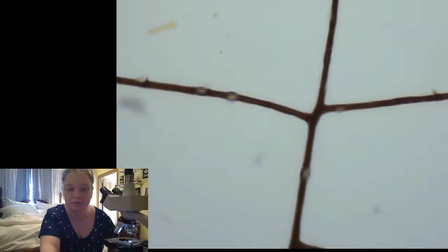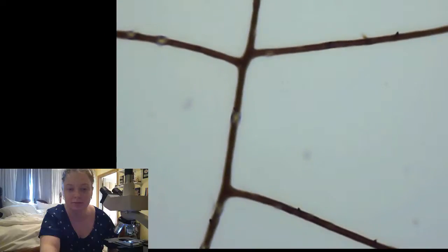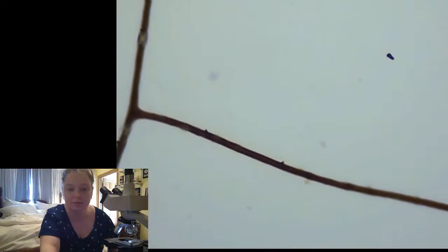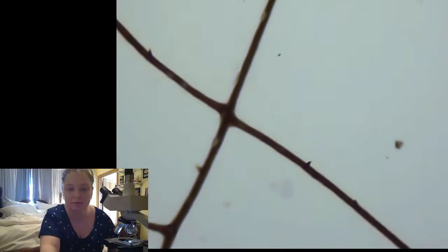It's kind of like when you fly out of a city at night, and you can see the way the city's in weird shapes. Except that this is not as regular. That's neat.